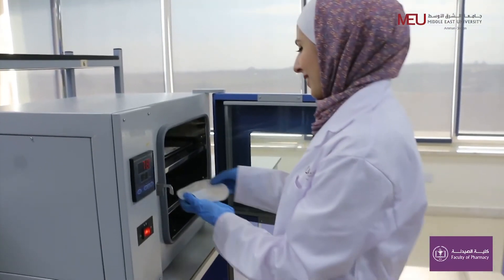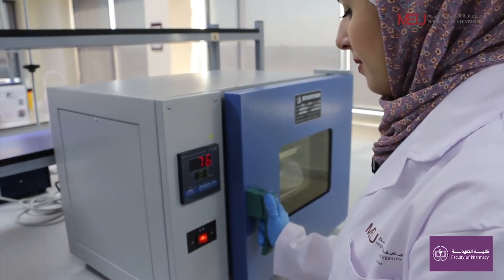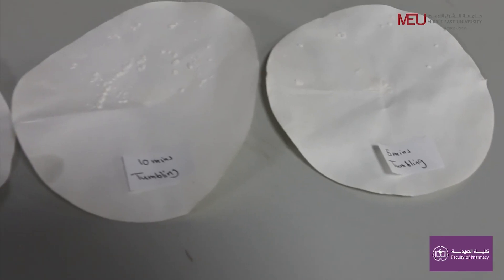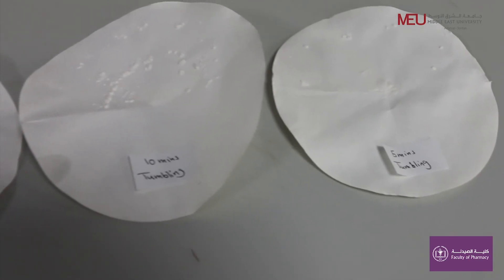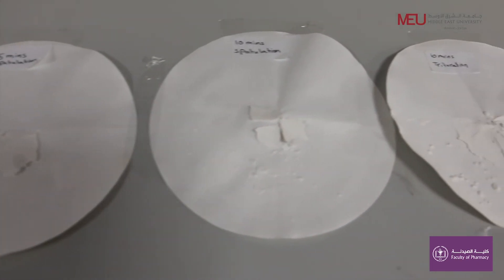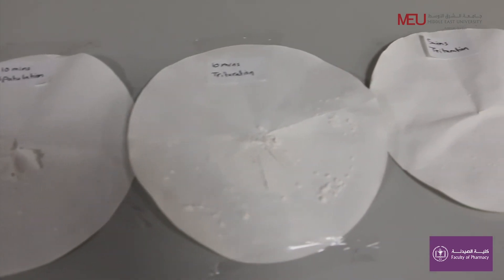Dry the filter paper in the oven and determine the amount of talc retained on the filter paper. Compare the results obtained after five and ten minutes of mixing using the three different methods.